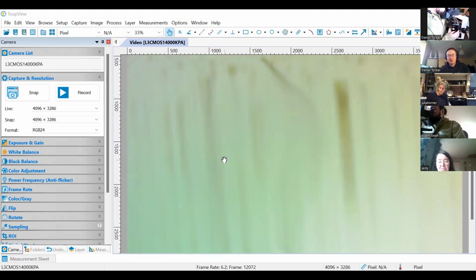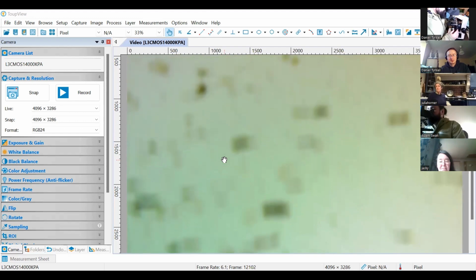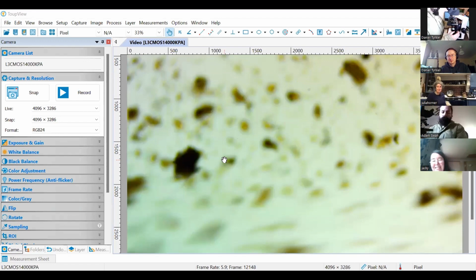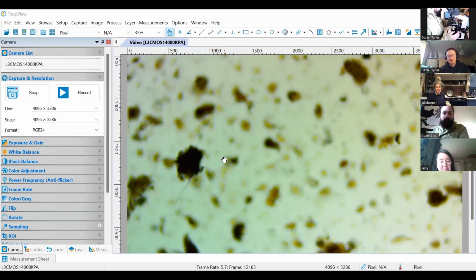I think Adam is just trying hard to find something interesting. Yeah, there's no nematodes in the sample. But maybe you could quickly share the key, Daniel. You got that open in the spreadsheet.